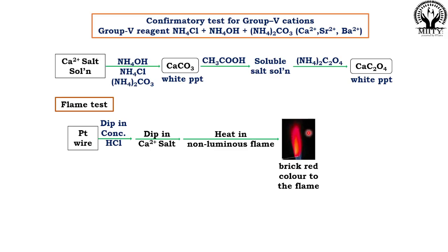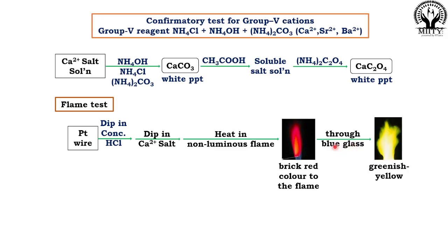Suppose if you see this brick red flame through the blue glass, it looks like greenish yellow. So like this, we can confirm the presence of calcium in the original salt solution.